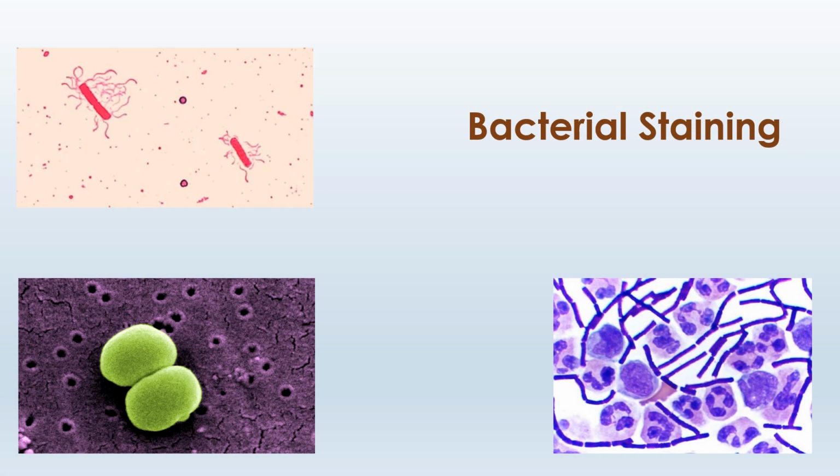Today the topic of our video is bacterial staining. That is an important topic in microbiology.